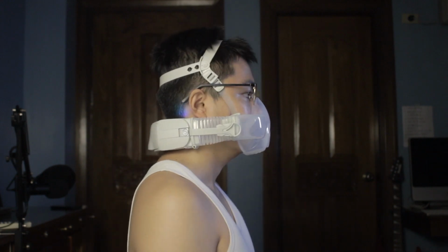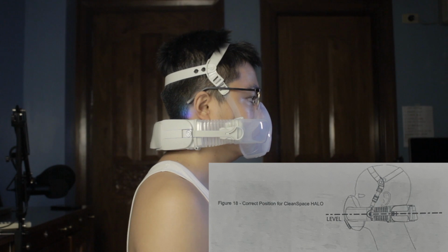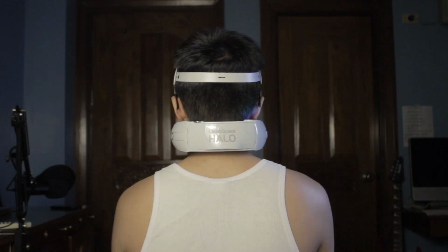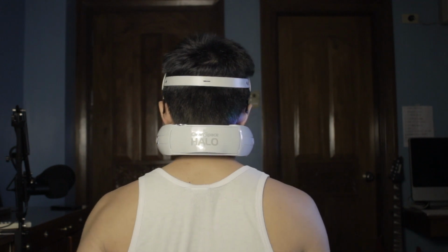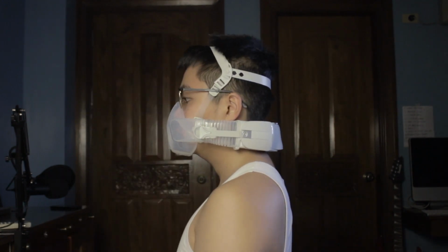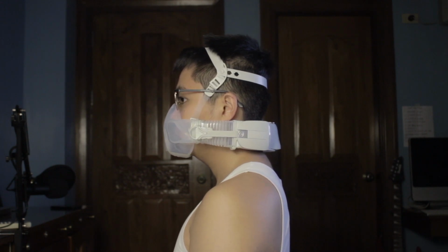Keep in mind that it is possible to wear your glasses over the half mask, and that it is not possible to wear your glasses inside the full face mask. At this point, I would like to encourage you to please read the manual, as there are other important instructions that you have to read before operating the respirator. Please don't use this video as your sole reference for operating the respirator. This is because incorrect usage of this respirator may lead to damage or harm to the user.